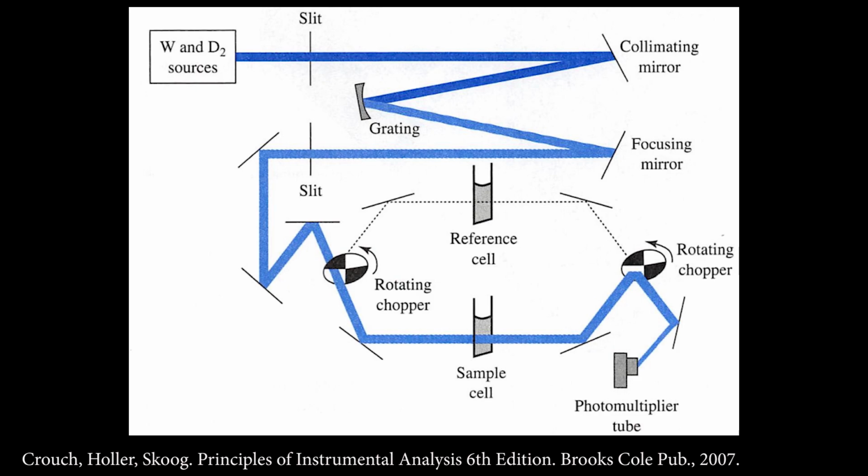That's called collimating. So you're going to have optics that are called collimating, and that can be either a lens or a mirror. With a lens, the light passes through it, and if it's a collimating lens, the light is pushed in one direction instead of just shooting in all 360 directions. It's forming a nice beam. A collimating mirror would be where the light bounces off of it, and as it bounces off, it forms a nice beam.